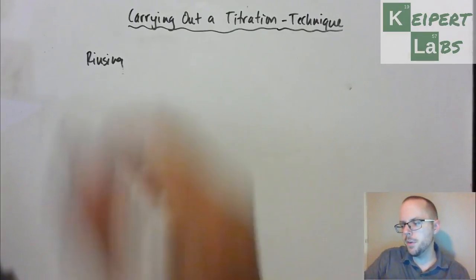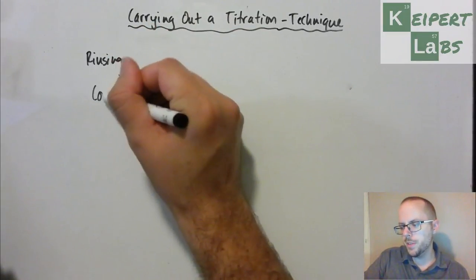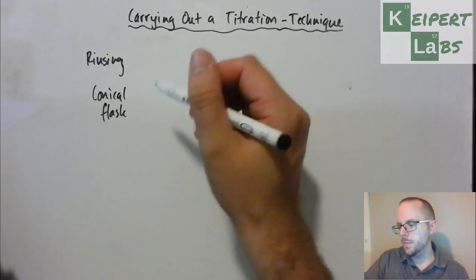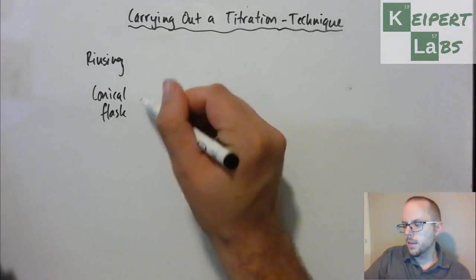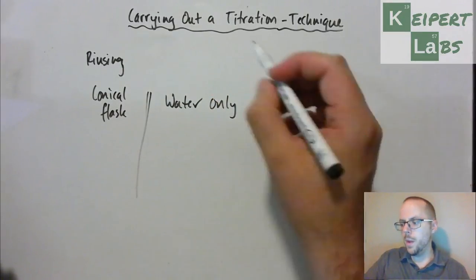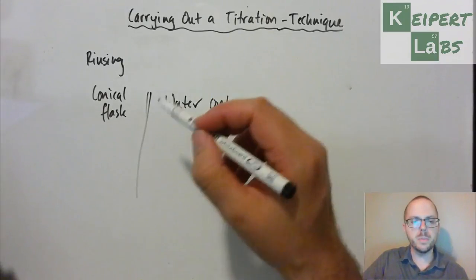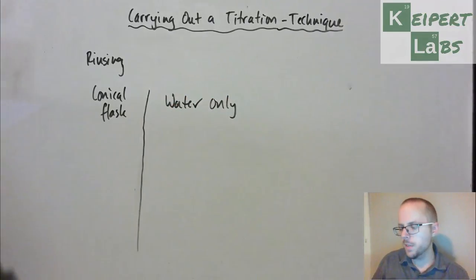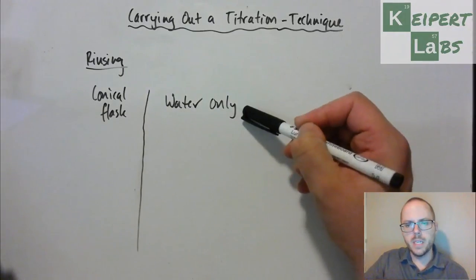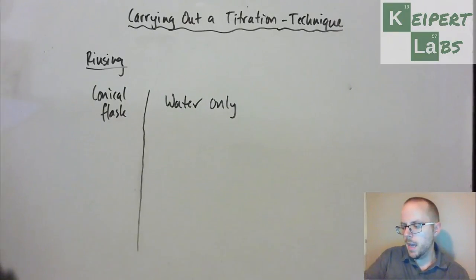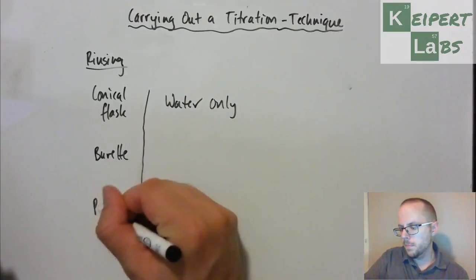So there's three main bits of equipment that we need to focus on when we rinse. First thing is our conical flask. Our conical flask, we rinse with water only. When we're talking about water, we're specifically thinking about deionized water here. I'm not going to mention it specifically each time, I'm going to take that as a given. So for a conical flask we only rinse with water. We'll see that that's kind of different when we talk about a burette and then a pipette.